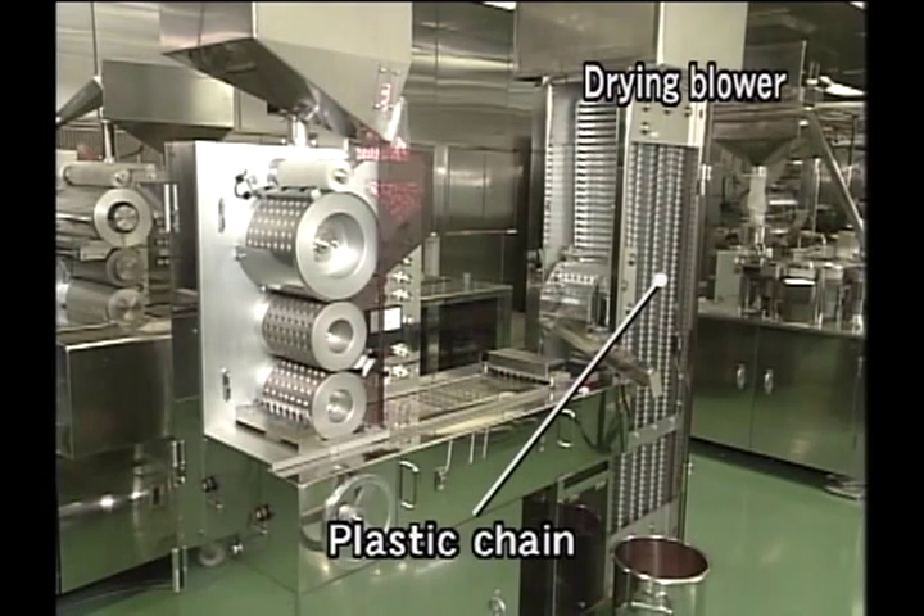In addition, we can easily increase the capacity of production by simply exchanging the drying unit itself.